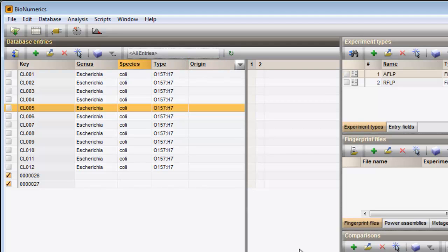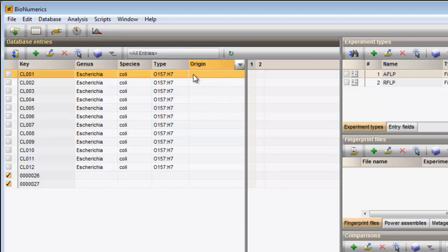Entering information can be done by entering the information directly in the grid panel. This is done by clicking twice on the field in the database.